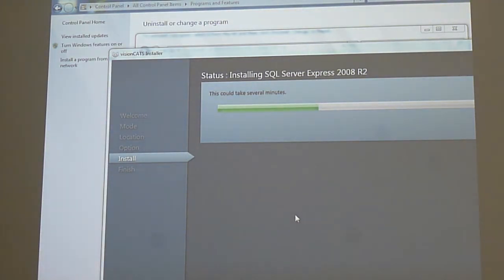So you see here now it is installing SQL Server Express again. We will see them later on. With that, we will have a completely new installation. And with that, we can do the restore, and then we have the change we made. And then I'm finished.